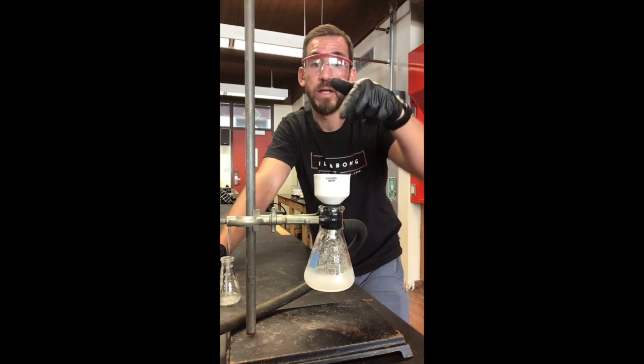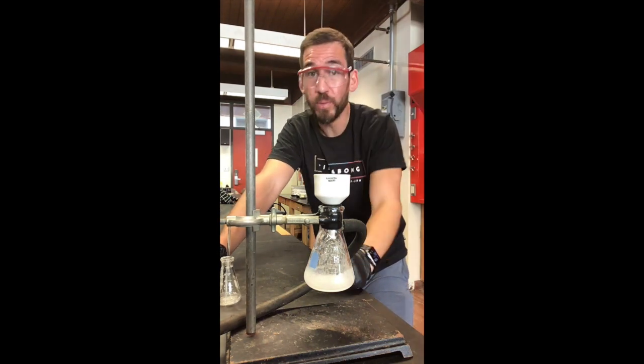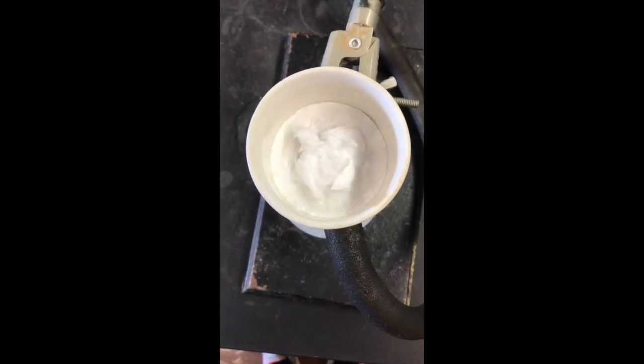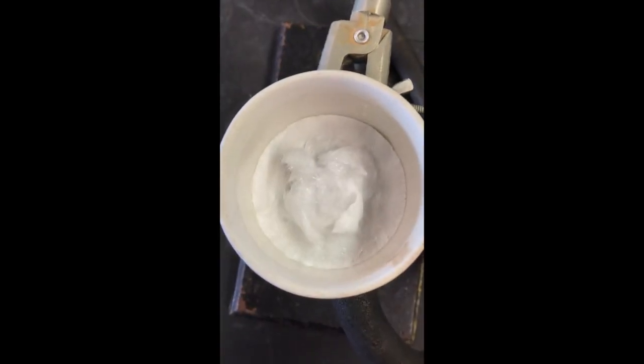But I'm going to show you this. It looks really cool in there. So let's take a look at that. Look at that. I love the way it looks.